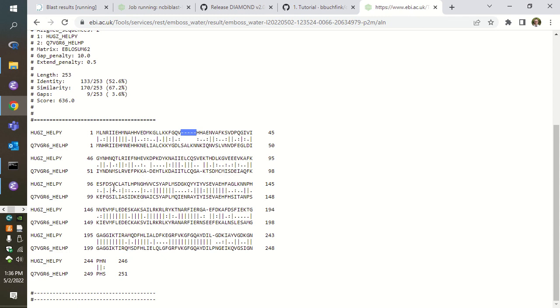But down here, let me see, I saw an example of this just a moment ago. Oh, I can't find it now. But sometimes we have a weak amount of homology between two letters. Here we have an alanine, and here we have a glycine. For evolutionary purposes, you can think of alanine as a glycine with a methyl stuck on it. So we can understand why those are at least tolerable in matching to each other.